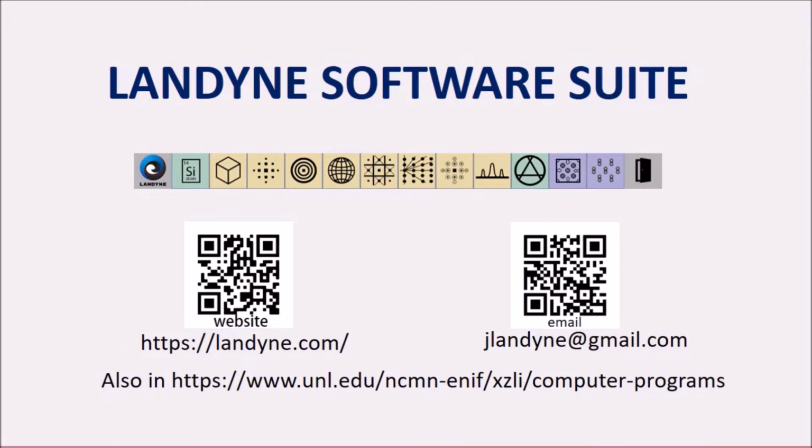In this tutorial video, I will introduce SPICA, a computer software for stereographic projection for interactive crystallographic analysis. This is one of the main components in the Landyne software suite. You may download the software suite from the website on the screen.